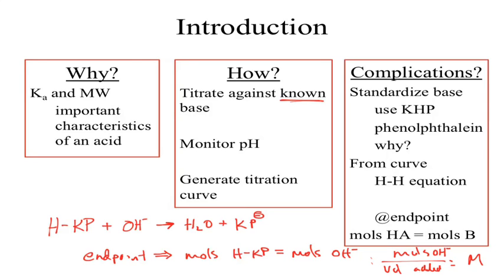At that point, you could be done. Depending on your skills titrating and how you make up solutions, you might be able to finish that part within an hour. Since we aren't going to talk much longer than this, you could then move on to the second part of the experiment, which is what's planned for Monday.